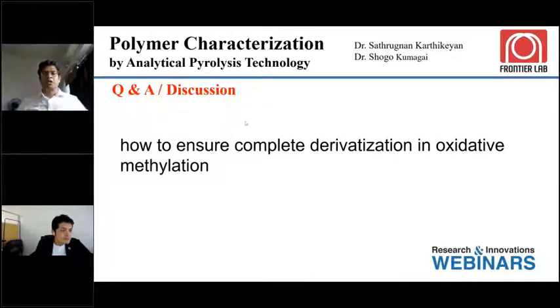Okay, we can optimize at an early stage of method development, where we can give different reaction times and see the peak results. This is how we optimize whenever you develop a new method. So you have to give sufficient time for your derivatization. But generally, since you are doing it within the furnace, you don't need to wait too long. Dr. Shogo, do you want to add anything here? Yes, extending the reaction time, and also you can check the pyrograms of the products. Then you can identify.